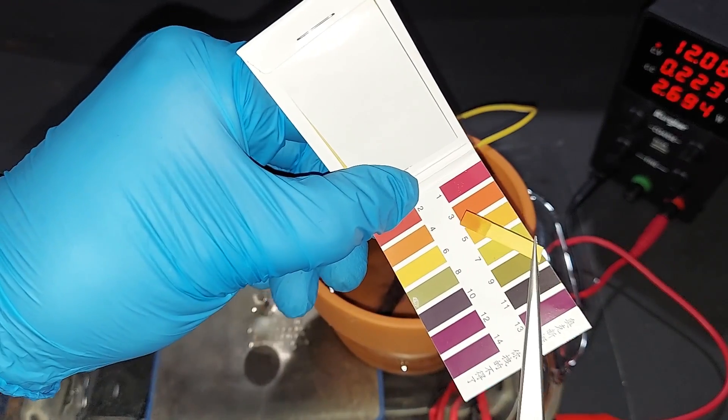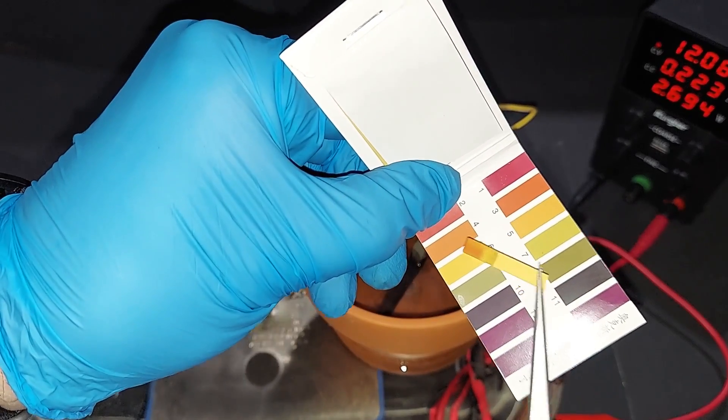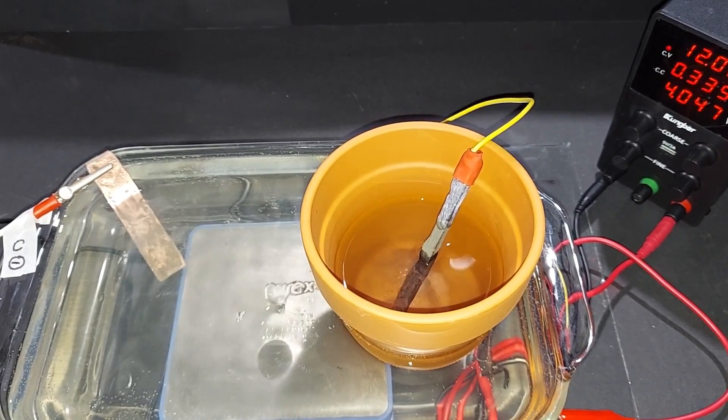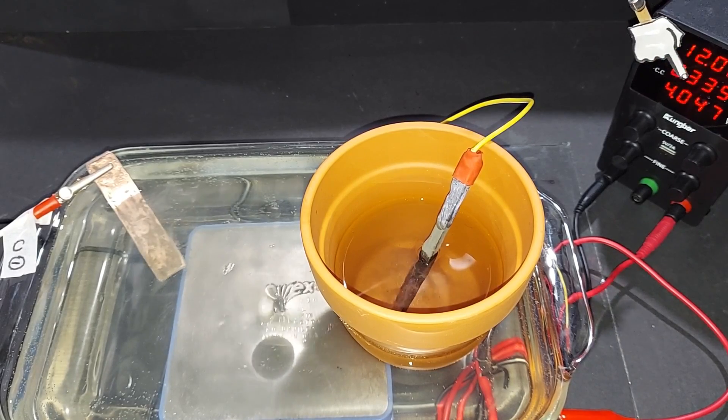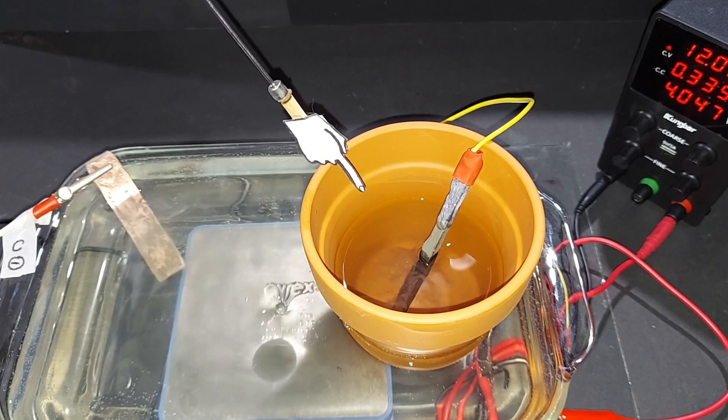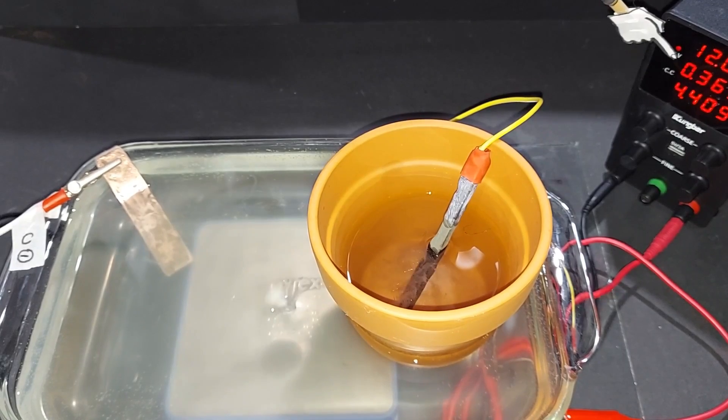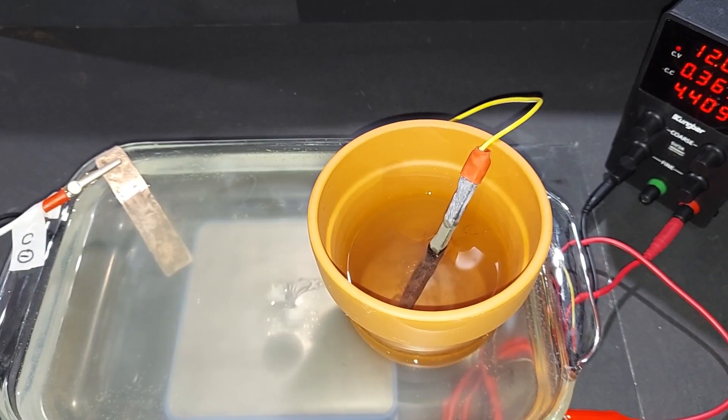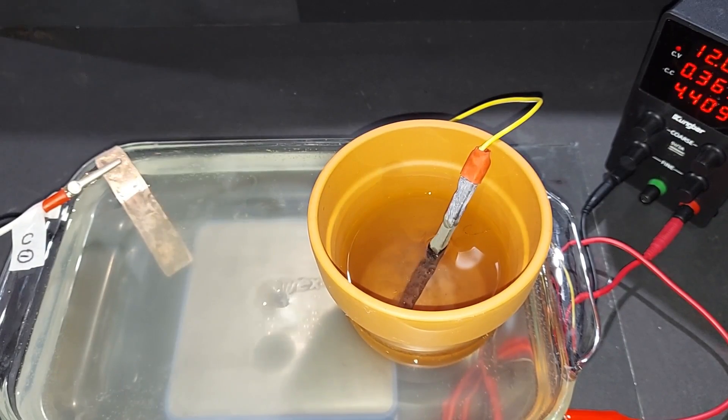We're two and a half hours out, up to 4 watts or 0.335 amps. It's climbed from 0.009, and this indicates how many ions are in solution. About three hours out, we're at 0.365 amps and 4.4 watts. What's becoming very noticeable is the magnesium hydroxide gathering on this side.